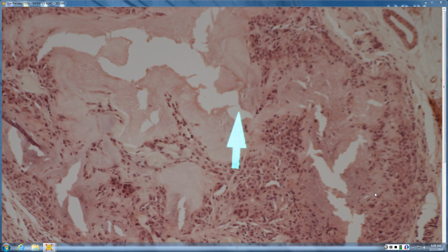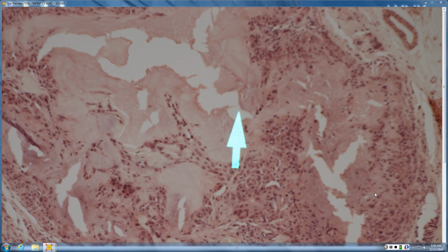What happens is that formalin actually destroys the crystals during processing, which is why you're not really seeing the actual urate crystals. What you're seeing is the feathery amorphous material, all the feathery clefts that are left after they dissolve out. So if you're really thinking that something is gout, the best way to actually cement it is to fix it in alcohol.